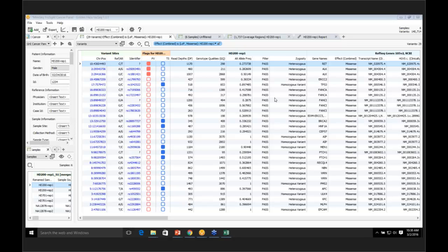Is VarSeq only designated for NGS, exome, or whole genome data? VarSeq can actually be used for a large variety of data. Basically, if you have your data in a VCF format, it can be imported into VarSeq, it can be annotated against, and it can be exported from. So basically, any data that can be represented in a VCF from a diploid organism can be pulled into VarSeq.